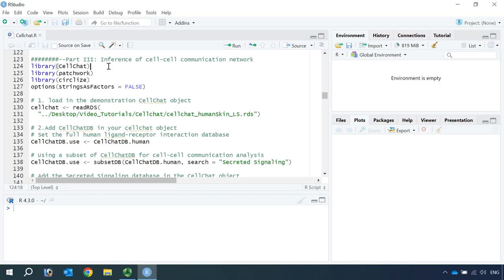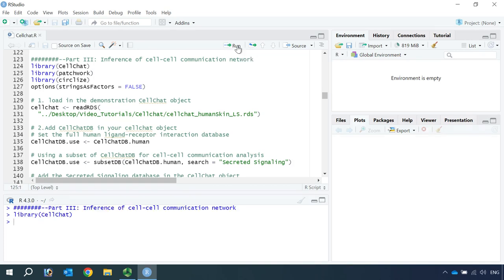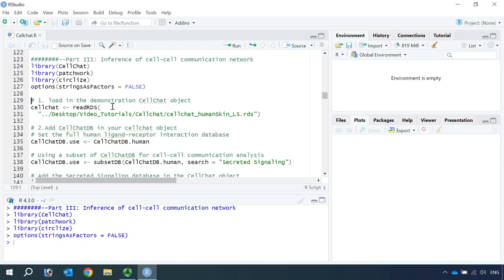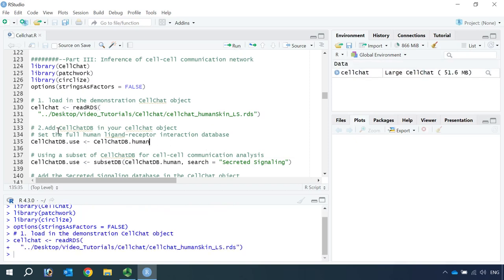First let's load all the packages: CellChat, Patchwork, circlize, and set the options. In CellChat video tutorial 1, we created a CellChat object and named it as cellchat_humanSkin_LS.rds, and we saved this object for today's analysis. So let's load in the CellChat object.